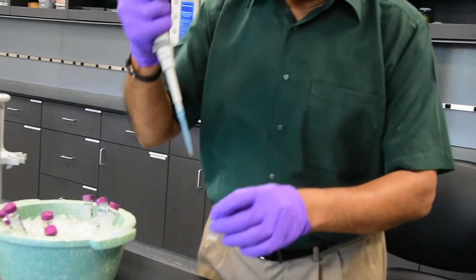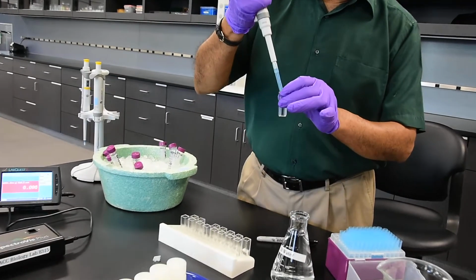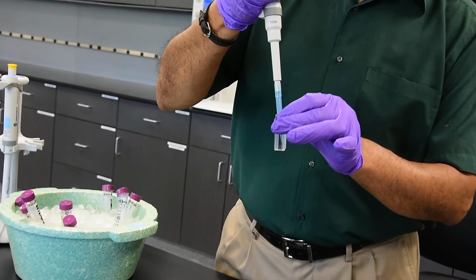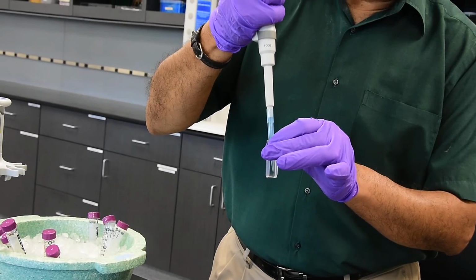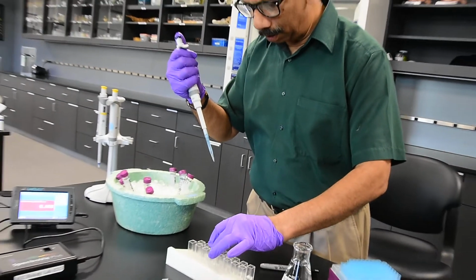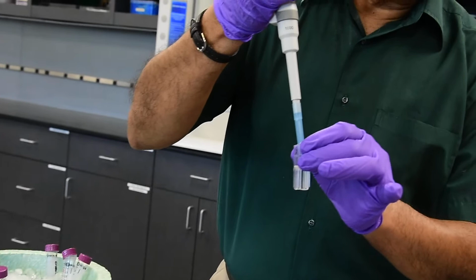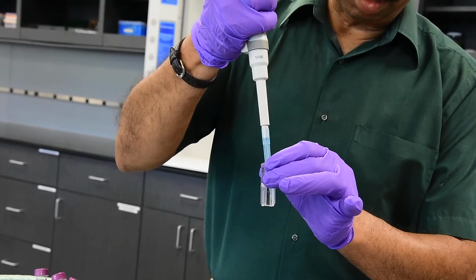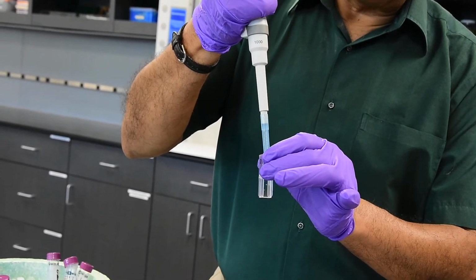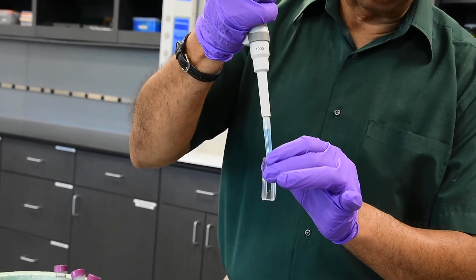Now I go to the 6th concentration, and here also you have to make sure that you're mixing it well. Then go to the last one, the 7th concentration. So the concentrations are becoming half and half, like 60 became 30, became 15, and 7.5 and so on.